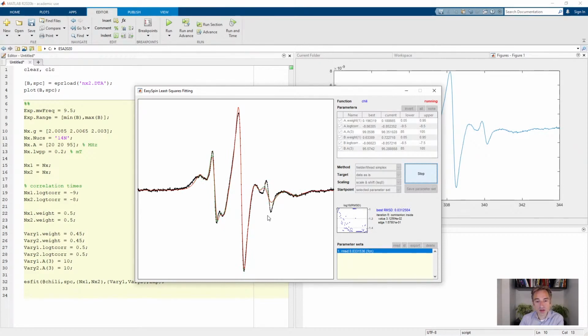We're not going to wait here for the final fit to finish. But the bottom line here is that you can fit a 2-component spectra. You could now deactivate some of these parameters, fit the others first, and then invert that around. That's often also a good strategy. I could, for example, stop this now, deselect everything, and now just fit the correlation times and see how that goes.